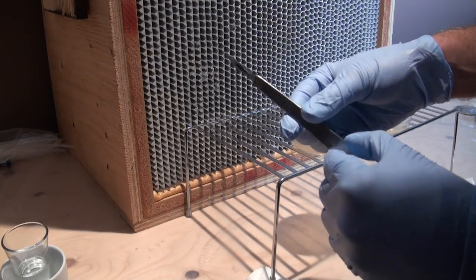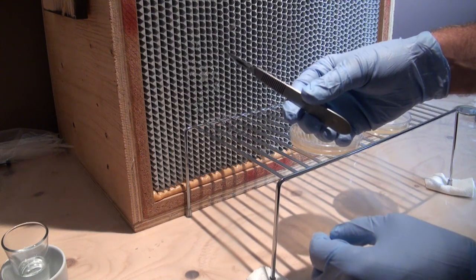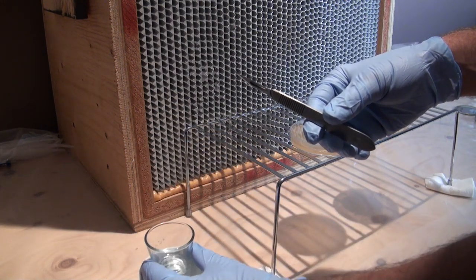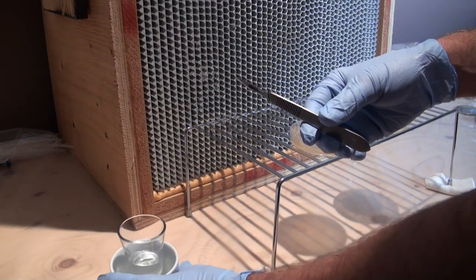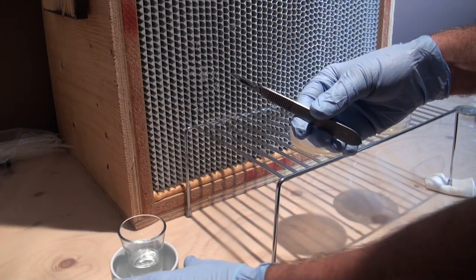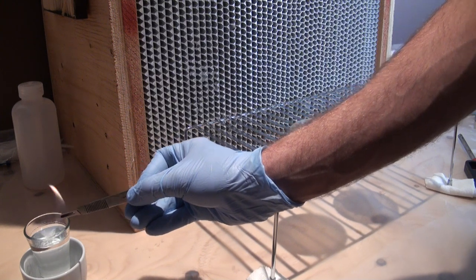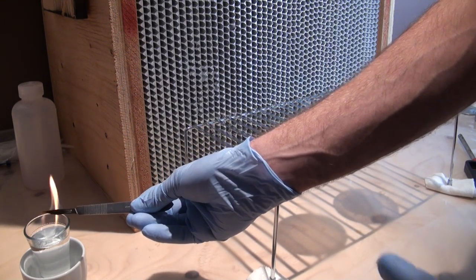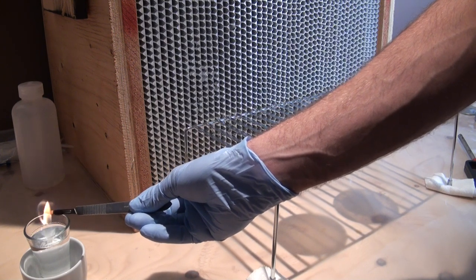To flame sterilize, you can use an alcohol burning lamp. Or if you don't have one of those, you could put some alcohol in a shot glass, just make sure you put it in a cup so the alcohol can't fall over. You want to flame sterilize your scalpel until it's red hot, and do this between every single transfer.